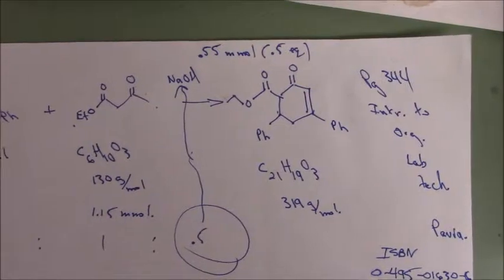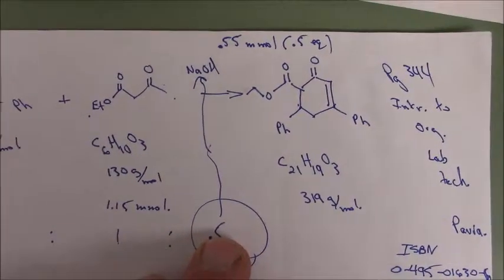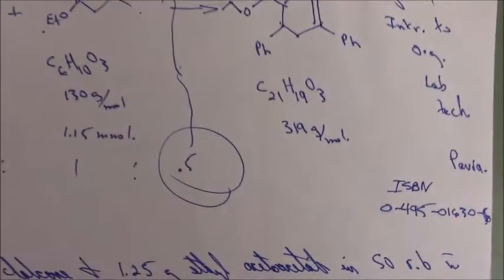Alrighty, what do we got cooking here? Number 8, at least it's experiment number 8 in 2019. So this is the typical layout, how it's often written, and the stuff that we see happening. The TLC that I have, basically the product when I ran it stuck to the baseline pretty good. But let's just get right to the IRs.